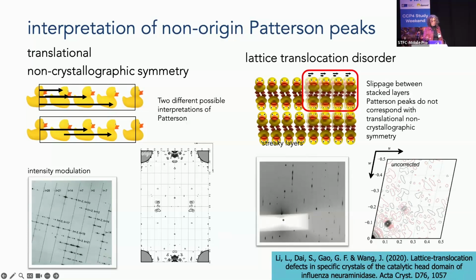But if you've got these rotational differences between them, it might be that you have a dimer separated by this 2/4 vector, and you need to be searching for these separately as another possibility for the interpretation of these vectors, where the breakdown between being translational non-crystallographic symmetry and just general symmetry is quite case dependent and case specific. So there's that problem of it.